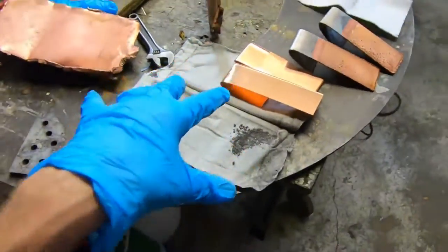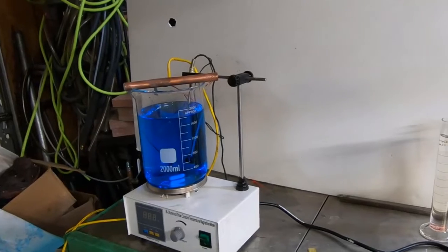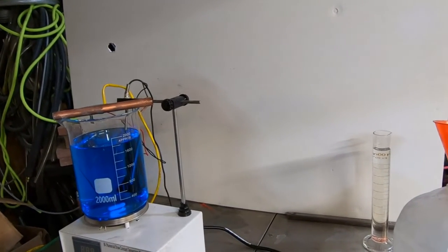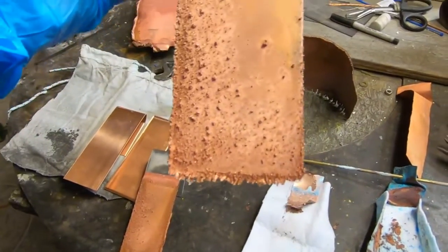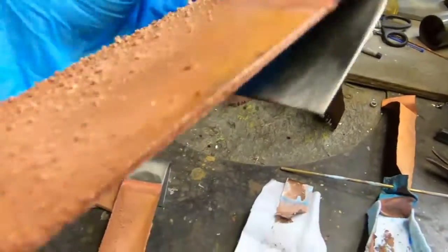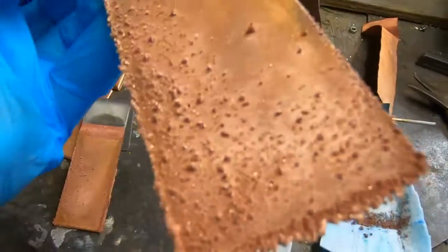So after we do that, we're going to make another solution. We will make up a new solution and run the test again using all pure copper to see if what we are interpreting as contamination is in fact contamination. If we get this same effect again, it's just going to be, oh well, Bob, you just don't know what you're doing. It won't mean that the contamination's really high. I propose we're not going to see this same thing happen, though.